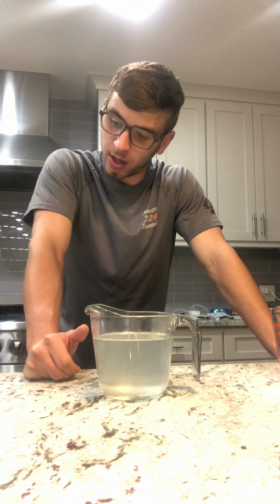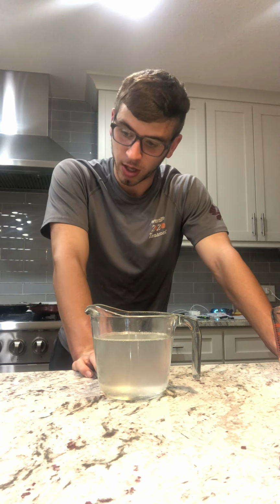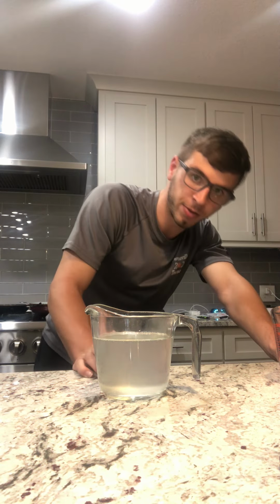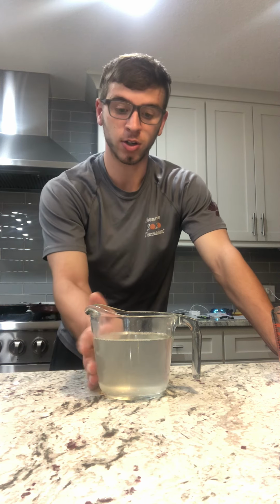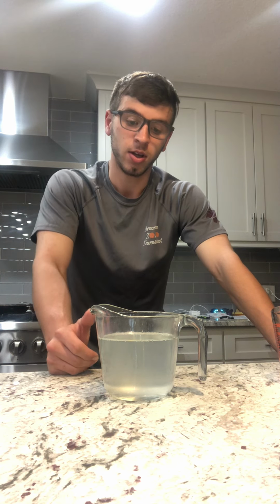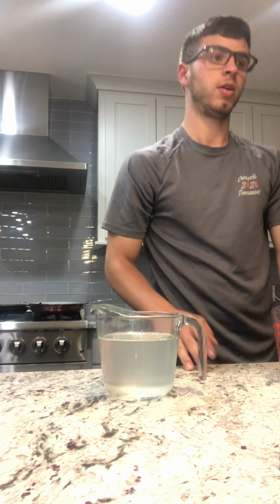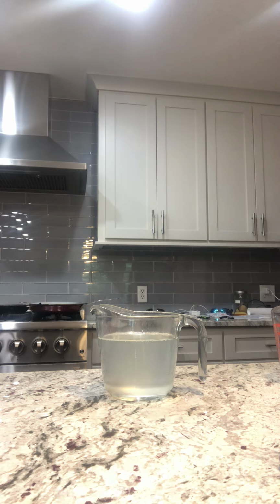But it would actually take longer if I were to increase the amount of ascorbic acid or vitamin C being put in here. And vice versa with the temperature: if we were to decrease the temperature, it would decrease the speed at which this is going to happen. So as we wait for this to go, I'm going to try and see if I can speed this up.